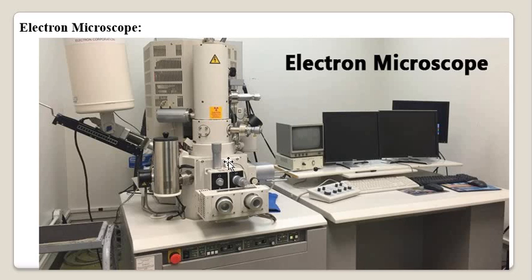It has not come out within one or two days. In the 15th century, scientists developed one single magnifying lens. After that, they developed the compound microscope, and then these inventions continued, and then the electron microscope came into existence. So the electron microscope can achieve a very high power of resolution, means it can magnify the image with great magnification, because it uses electrons of much shorter wavelength, and the shorter wavelength gives more magnification and clarity to the image.